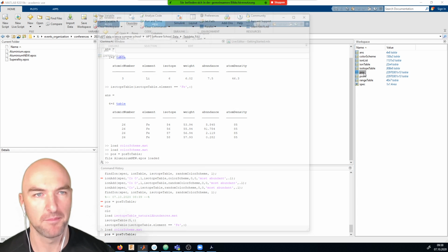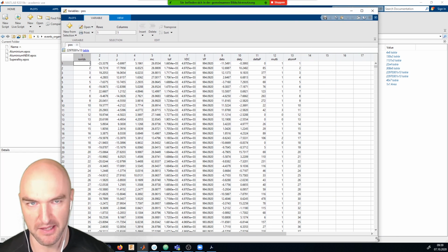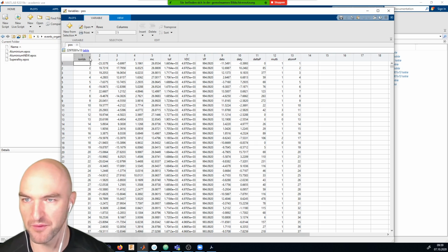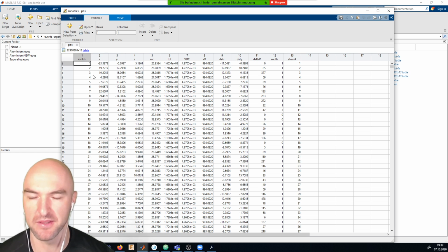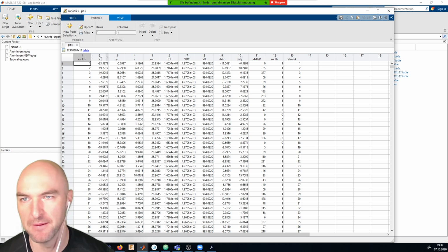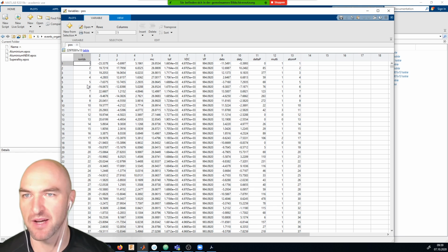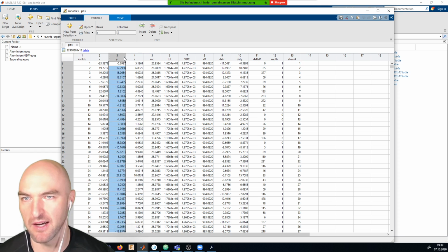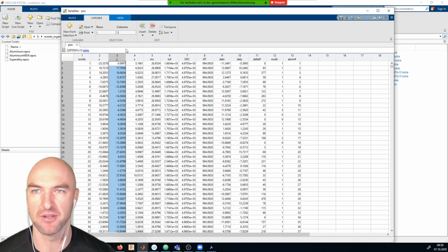Okay, and now we've got our pos file here, and I can just click on it, and you can see it's very descriptive. So we've got the ion index. So what ion that is, which is very important when later we go and split the complex ions up. So right now this is obviously just a running number. Then we've got the reconstructed X, Y, and Z positions. And if you click on the little arrow here, you will see that the unit is nanometers.